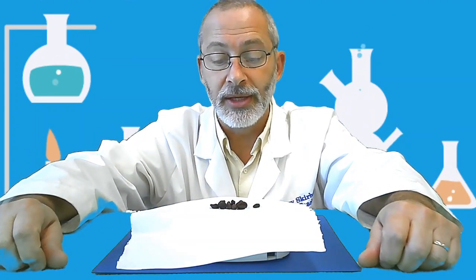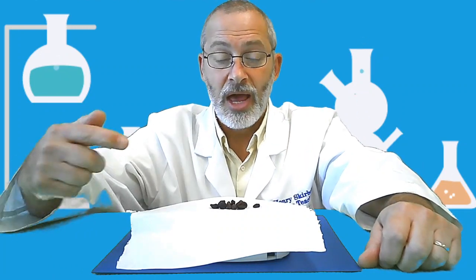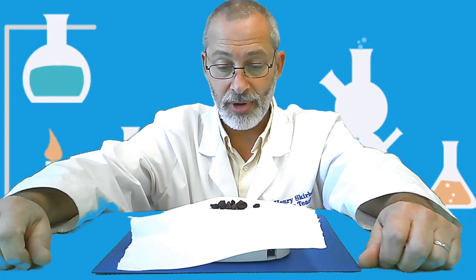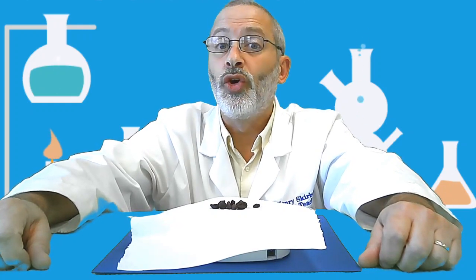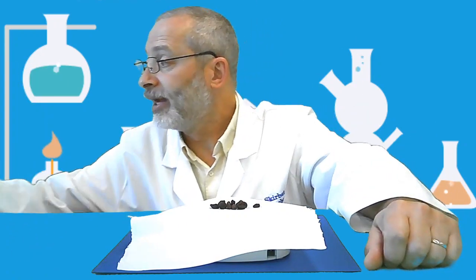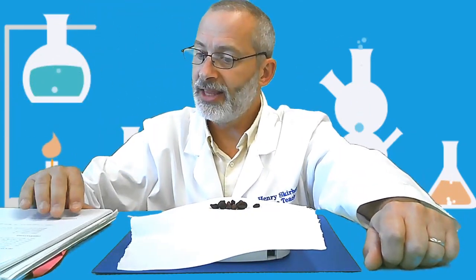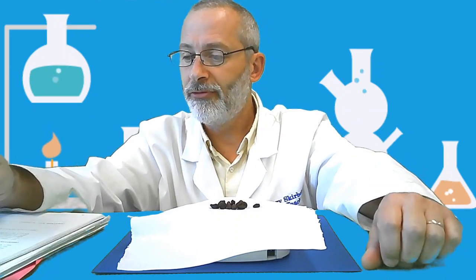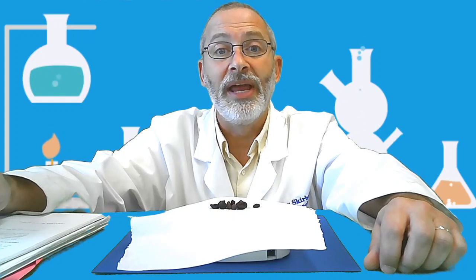So, that's a nice number. So here we go. We have our 10 dried raisins have a mass of 5 grams. 5 grams. So on page 44, make sure you're writing that down. The mass of raisins on day 1, 5 grams.